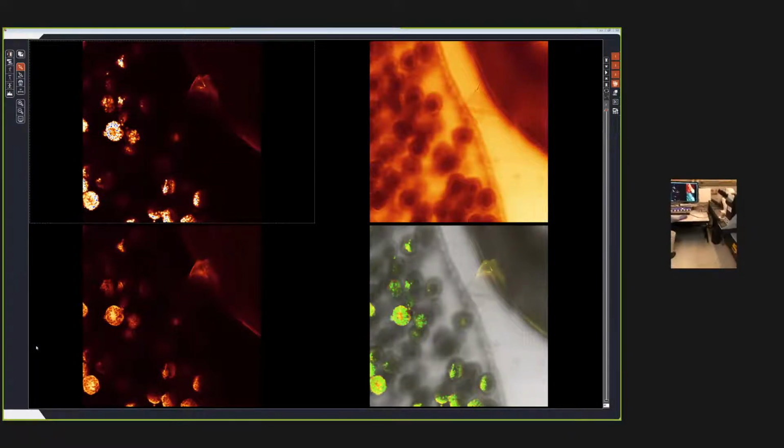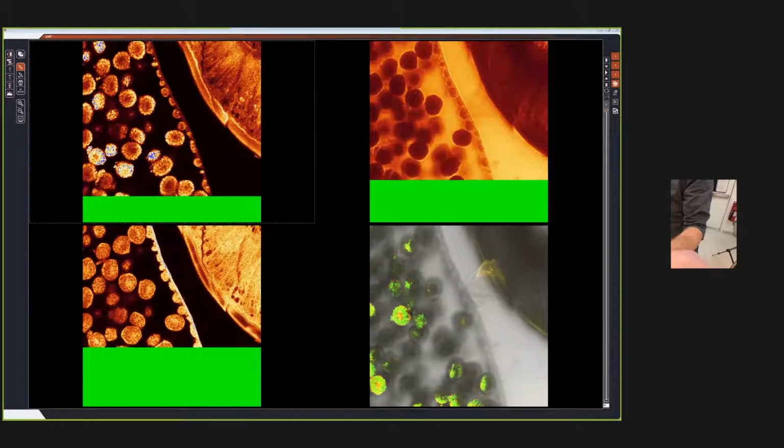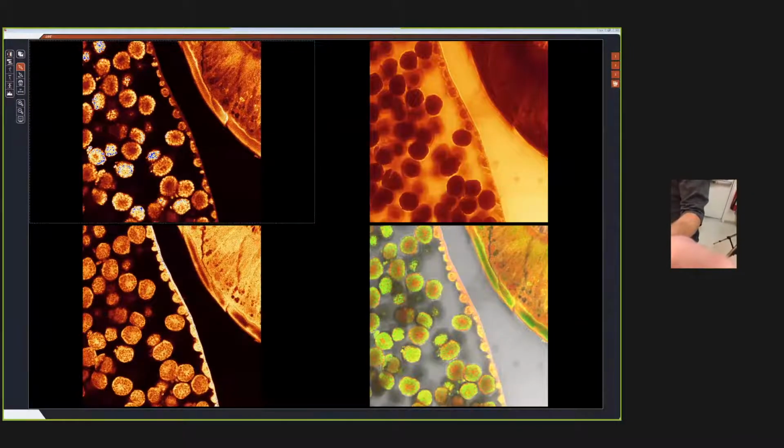So where we are right now is in the light microscopy facility, and Mike is sitting at the control station of a confocal super resolution microscope, which is over here on the right. They are using your video feed. What we're seeing here, you can see the screen updating, is a live image of one of the slides we just imaged. It's a slice of a worm.